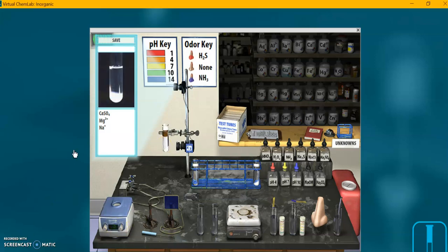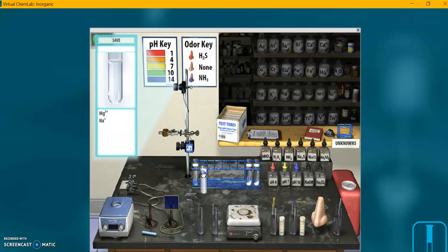Again, I'm going to spin it in the centrifuge. See, we proved we have our precipitate. I'm going to decant. There we go. I'll set this aside again.